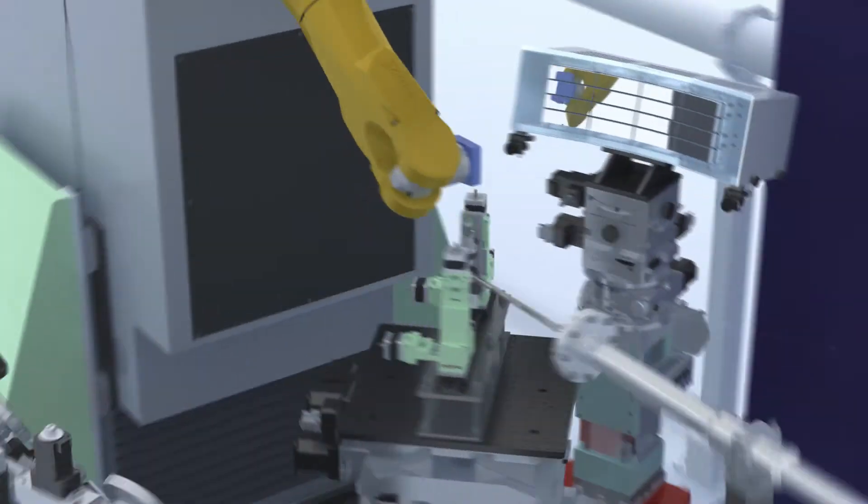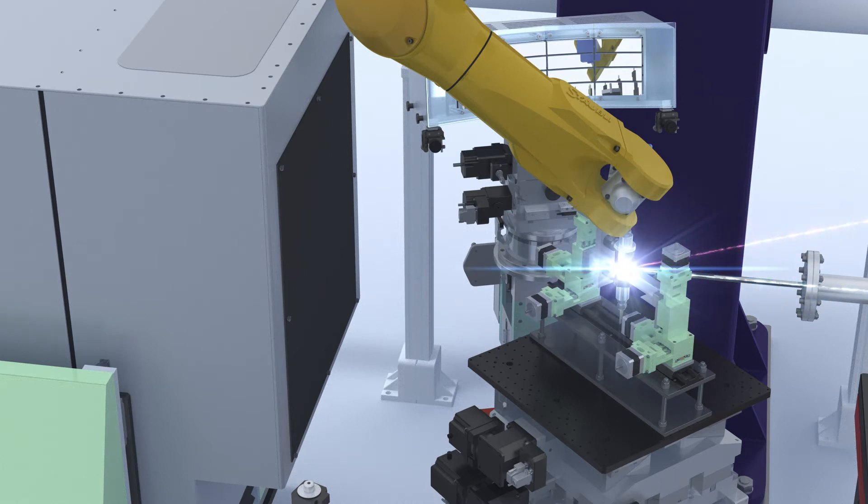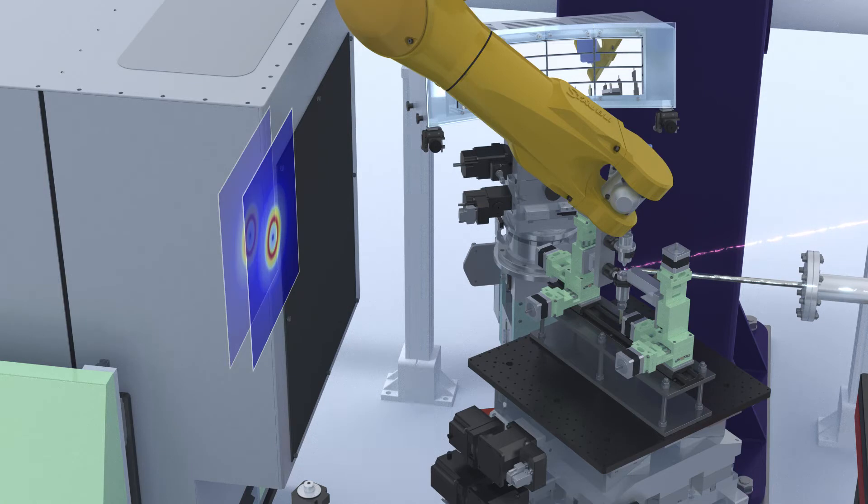With the European XFEL's 27,000 intense X-ray pulses per second, shown in blue, the instrument can record snapshots from the reacting molecules in steps of a millionth of a billionth of a second, or a femtosecond.